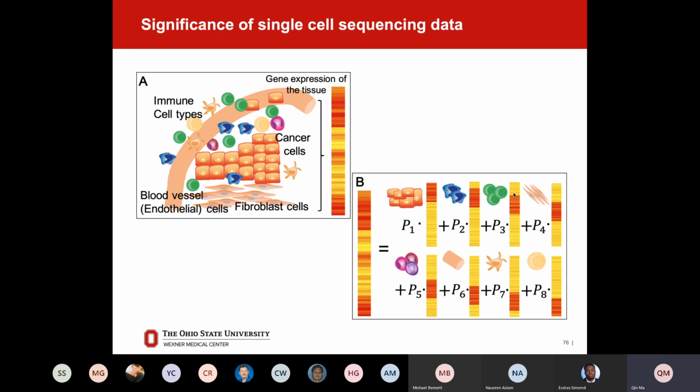Just a quick review of what we introduced: why we need to analyze single-cell data. Considering the high heterogeneity encoded in complex disease tissue, with multiple cell types there, we need to figure out the specific expression patterns encoded in a cell type or cell state. Then we have a strong power to interpret the whole tissue system, and furthermore to treat complex diseases.